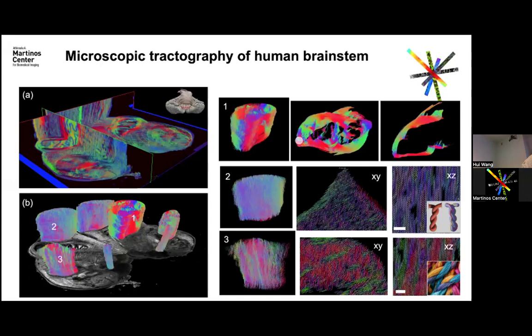Yeah, so this is 10 by 10 by 100 micron.